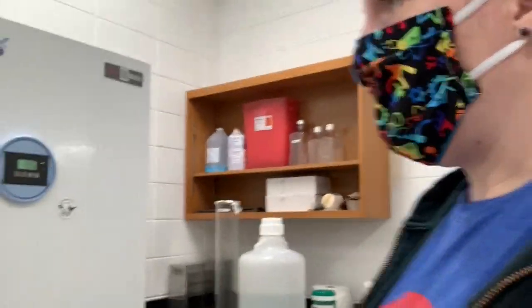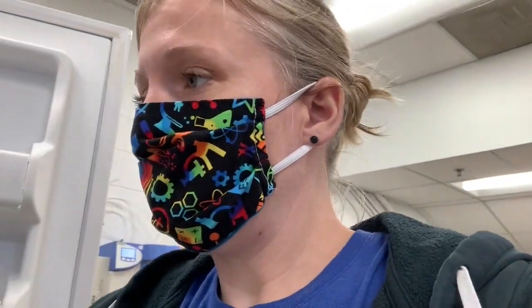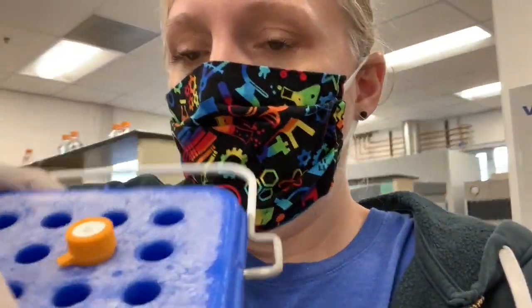And then I'm going to go get the DNase from the freezer. I will take you with me. So my bay is closer to the door, and the common reagent freezer is in the other side of the lab, right here. And again, this is one of the enzymes we use, so we want to keep it on a cold block and always get it out right before we need it, and then put it back right after we use it. The DNase that we're currently using has an orange lid, and we'll say RQ1 DNase on the top.